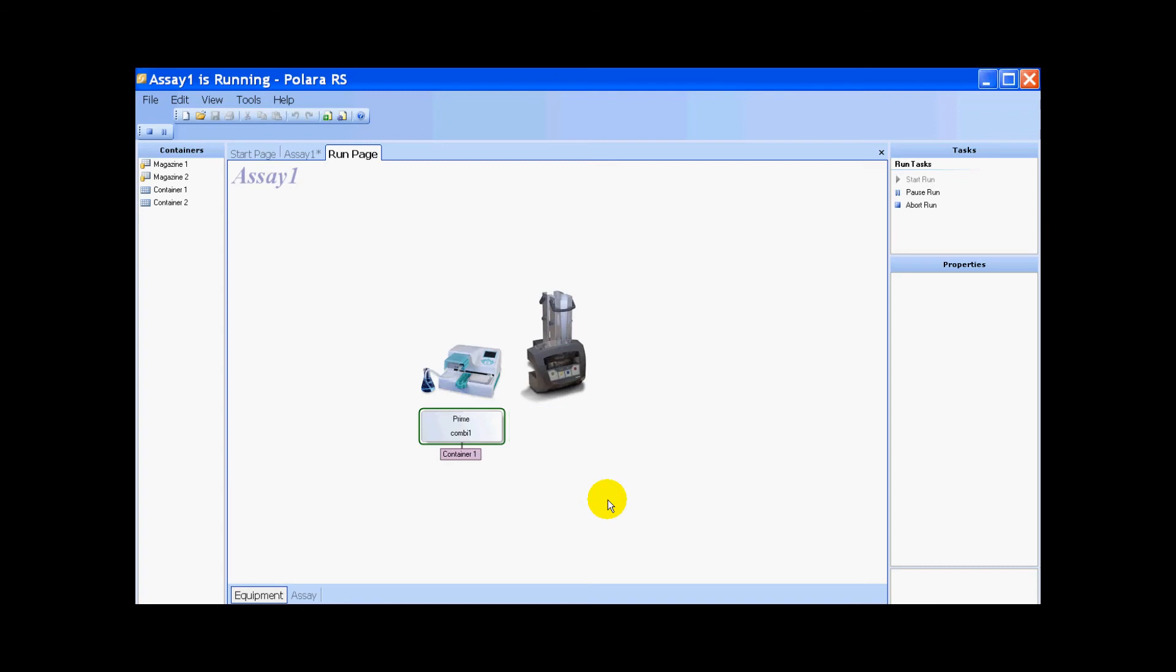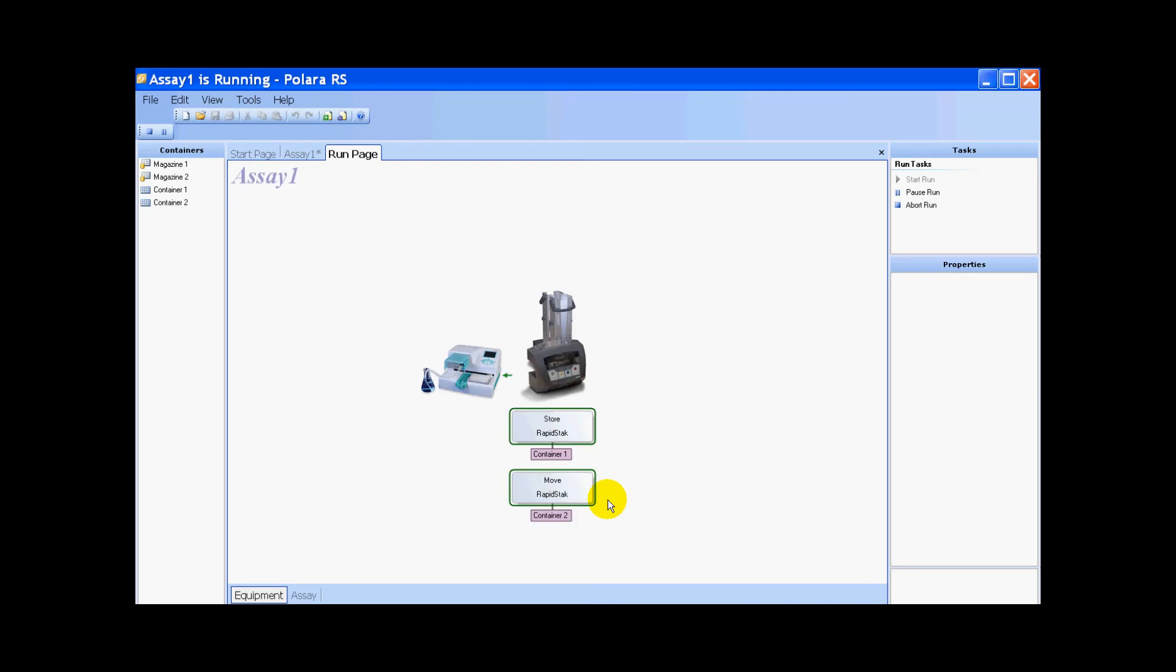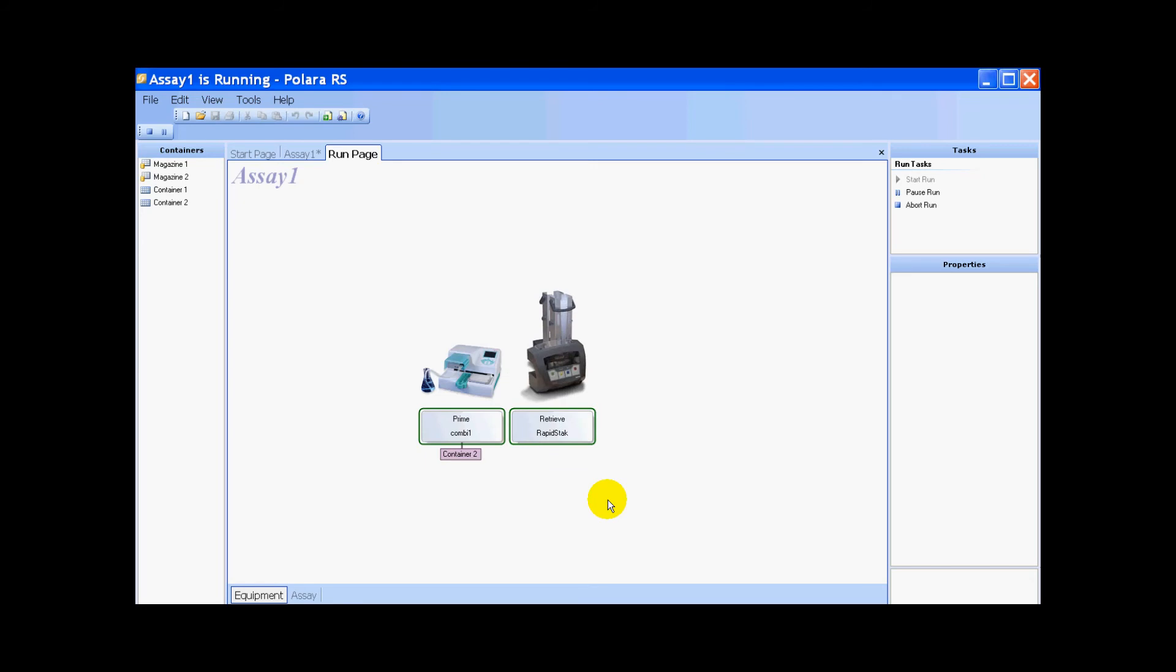Because in the setup I put two plates, it's going to run the process two times. It's priming the combi again to do the second reagent run, and it's running a protocol. Now it thinks it's sending the plate back to the rapid stack, but it's just the same plate sitting there. It won't start the next plate until it thinks it's received it, in sort of robot time.